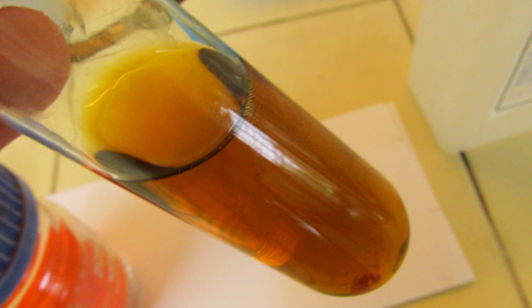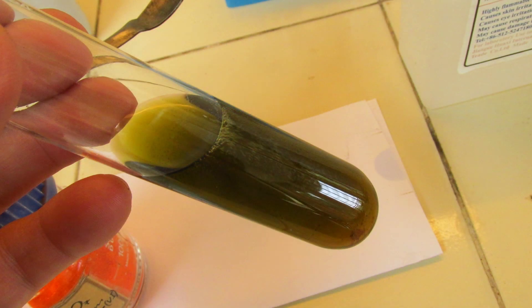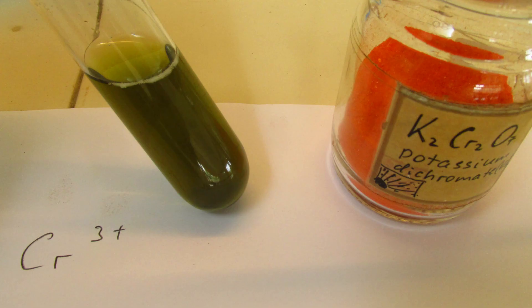If I add more ethanol though, and help the reaction by heating up the mixture, I would see that color changes nicely into green. Green is due to reduction of chromium 6 in potassium dichromate 6 into chromium 3 ions, which are green in water solution.